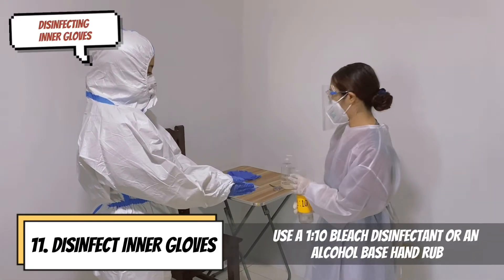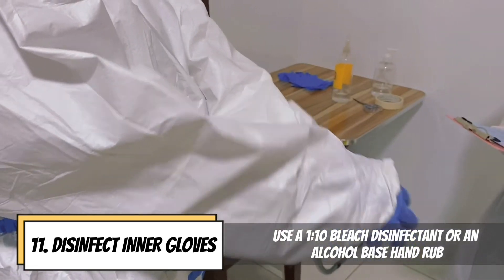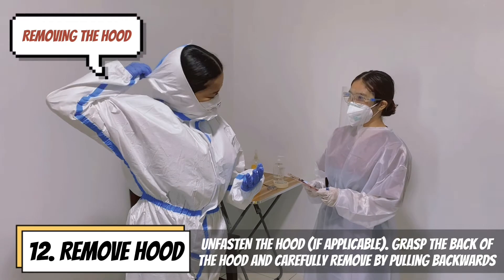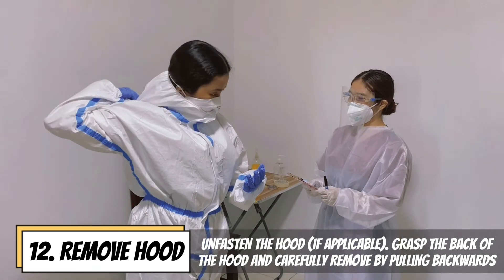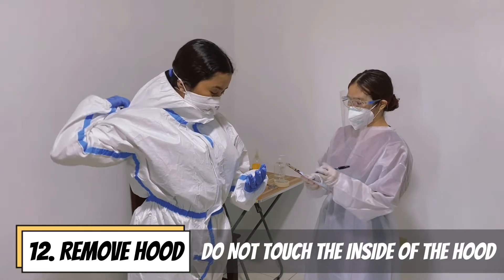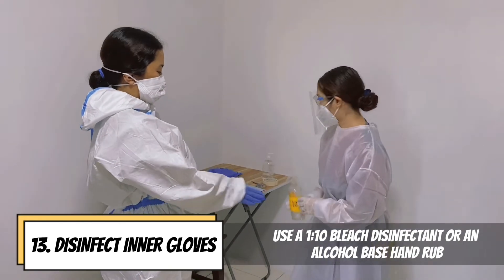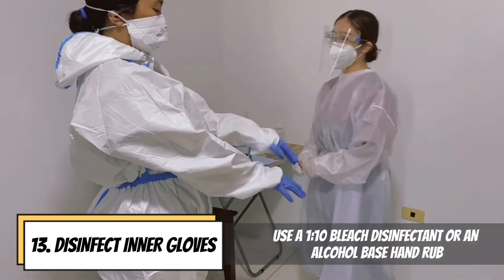Disinfect inner gloves using a 1-to-10 bleach disinfectant or an alcohol-based hand rub. Unfasten the hood if applicable and grasp the back of the hood; carefully remove by pulling backwards. Do not touch the inside of the hood. Disinfect inner gloves using a 1-to-10 bleach disinfectant or an alcohol-based hand rub.